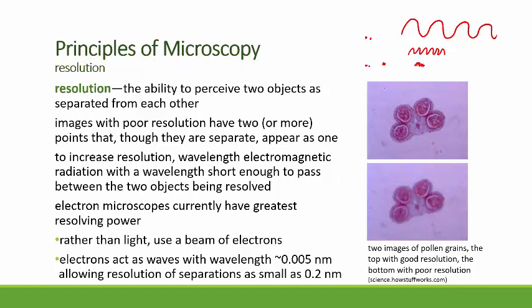But the best we can do with a light microscope is about 1000x. And that's what we'll be doing. Most of our microscopy work will be at 1000x with these microscopes. Okay, so that's resolution. So just to review, we've talked a little bit about light and how light energy is just one small segment of the entire range of electromagnetic energy. And so we use light with light microscopes, but we can use much shorter wavelength electromagnetic energy when we employ tools like electron microscopes in order to resolve very, very, very small structures.